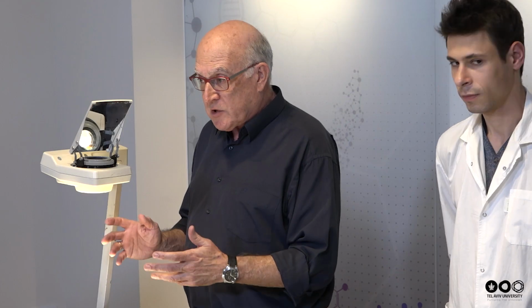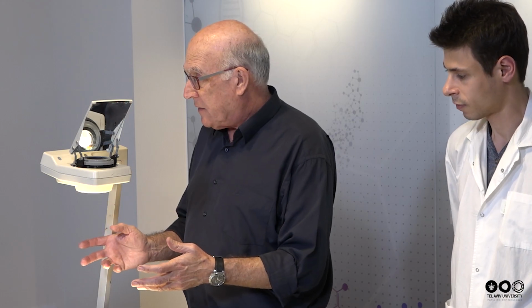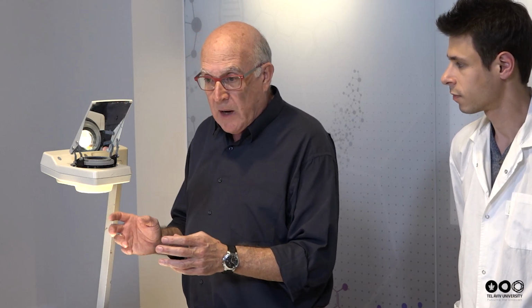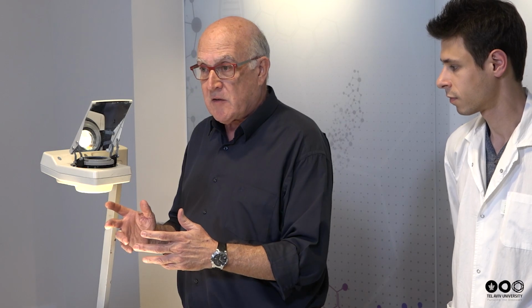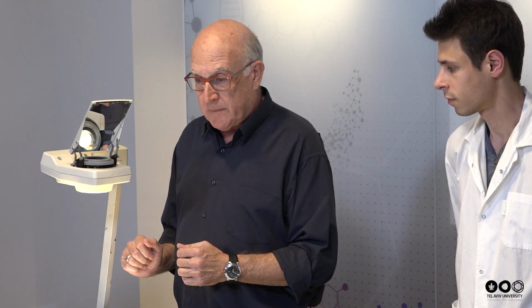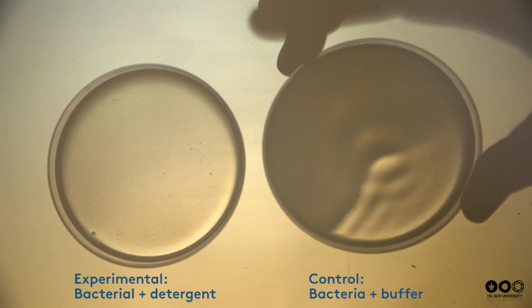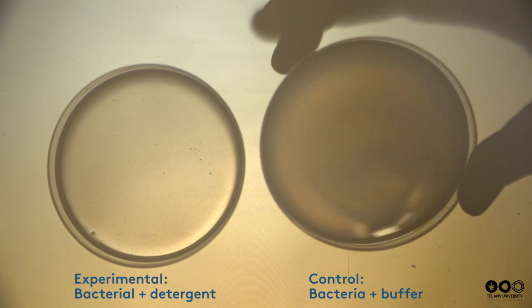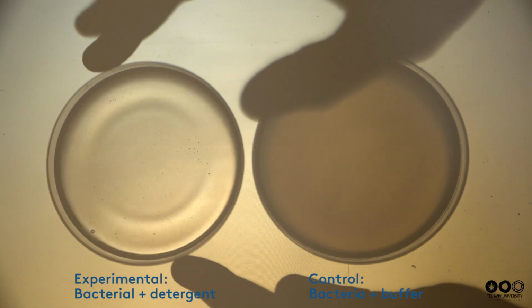However, detergent has in fact dissolved the bacteria. And the bacteria no longer act as individual particles. The light coming through the dissolved bacteria has greater intensity, and we can see that it is cleared. As you can see, the control bacteria flow evenly and give us a rather easy-flowing, uniform solution. Let's see what happens with the dissolved bacteria.